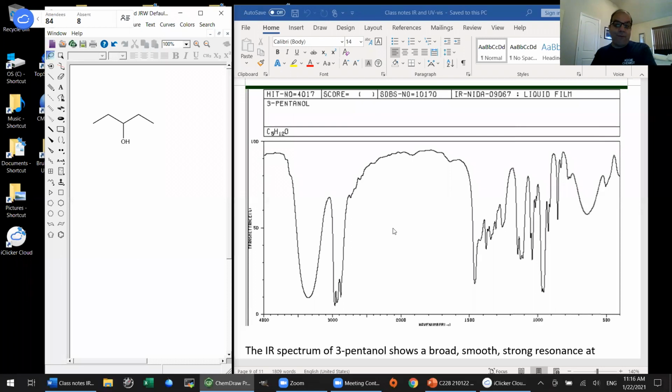Good, but from this we can also tell, again, there's certainly no carbonyl. I don't see any of those strong peaks at or around 1700 wave numbers. All of my CH stretches, meanwhile, are below 3000 wave numbers, so I do not expect that there's an aromatic ring or carbon-carbon double bonds. As usual, I could no more tell this is 3-pentanol than 2-pentanol.